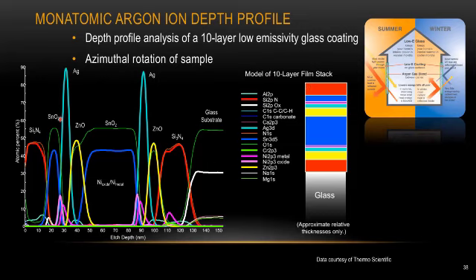The data on the left is atomic percentage versus depth. You can see that initially we scan the top surface and that only gives a signal from the silicon nitride. But doing depth profiling and going into our sample, we can see a few different oxide materials and also a material layer of silver right here. Using this data, we can study the impurity in each layer, the depth of each layer, and also the interfacial region between two layers.